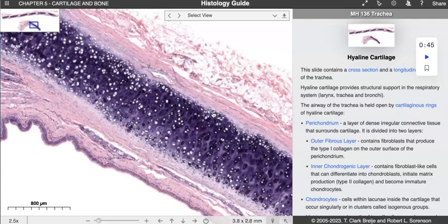So would the blast be out here to the periphery? Well, if this was a developing section, then yeah, that's where you would find the chondroblast adding cartilage to the periphery and to the outer surface. But because this is an adult tissue, and you can see that the lacunae go right to the surface, right? And both sides, that we do not have chondroblasts at this time. Not to say that there's not a few in there, but primarily this is all going to be adult tissue.